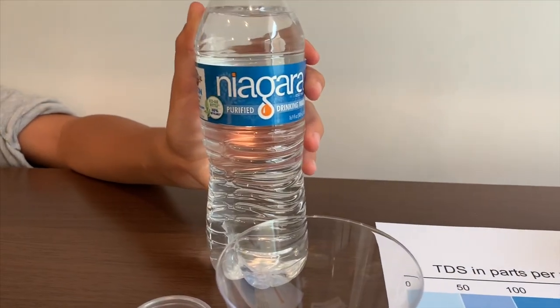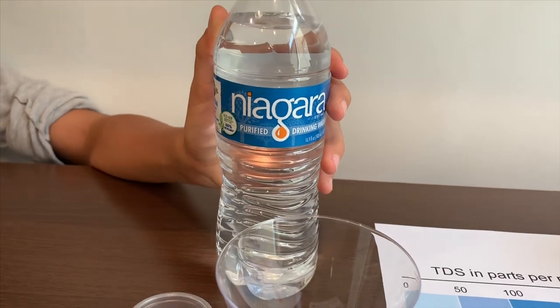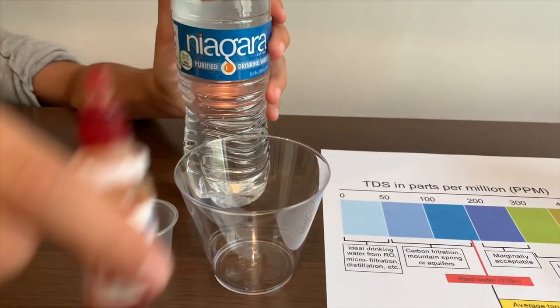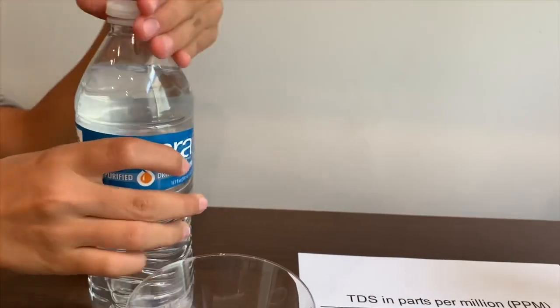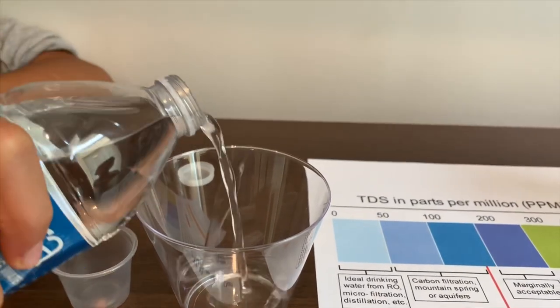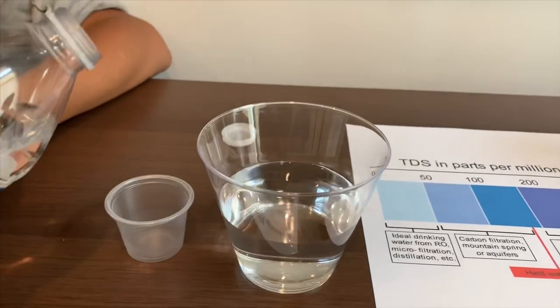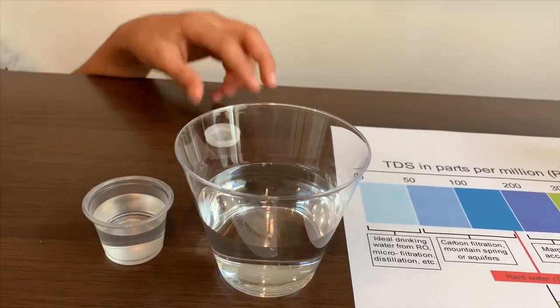This is Niagara Pure drinking water. We're going to test the TDS level and the pH level. First, let's open the cup and pour some water in. Niagara water costs only $1.